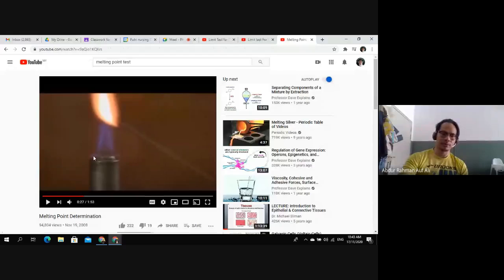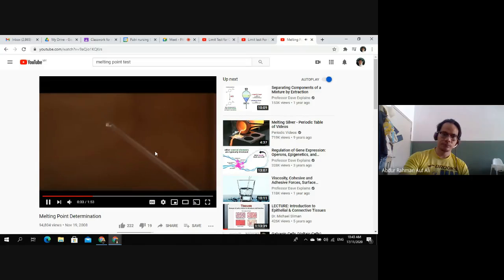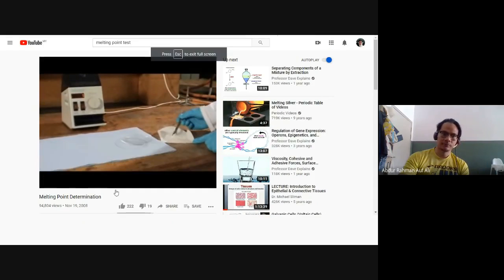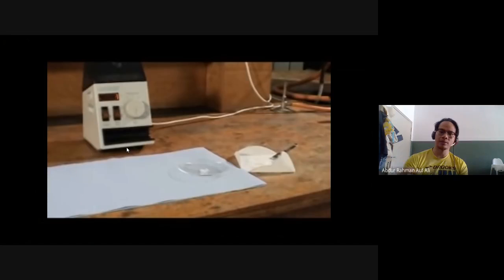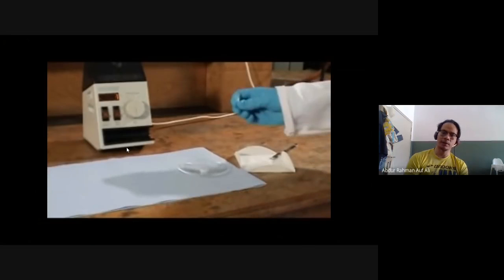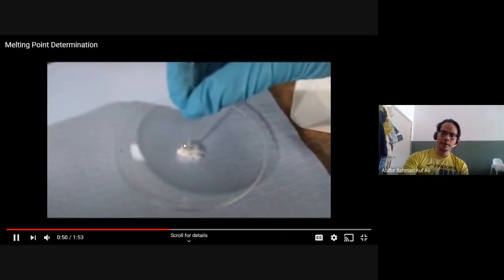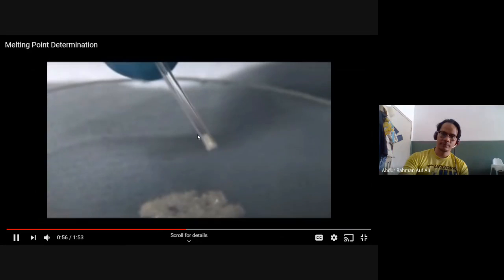Okay. How do you perform this video here? Just 2 minutes, less than 2 minutes. So we need a capillary tube, macam dia pegang ni, very halus, kaca. So kalau kita ada tablet, kita perlu hancur. We need to grind the tablets first, hancurkan dia jadi halus, macam ni. Kemudian ambil the capillary tube, masukkan the powder of the tablet dalam capillary tube, just like this.